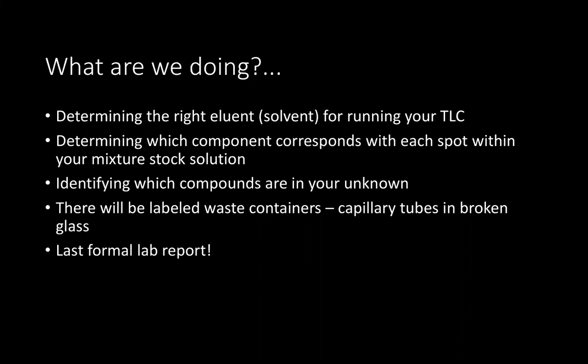Just a note, there will be labeled waste containers, and your capillary tubes are glass, so they should go in broken glass, even though they may not be officially broken. We shouldn't reuse them. This is going to be your last formal lab report, so make sure to take plenty of notes, pictures, sketches, whatever you need to get a good lab report created.